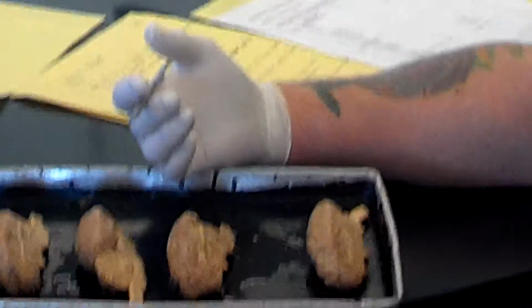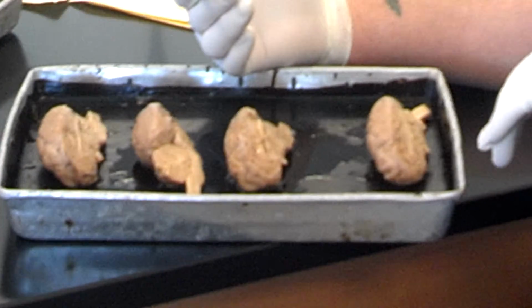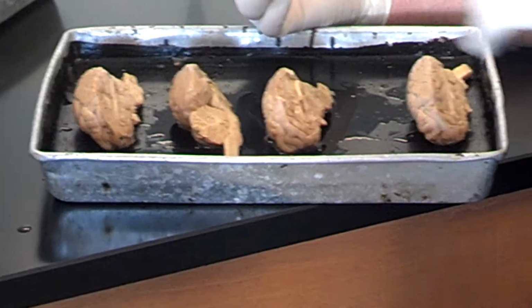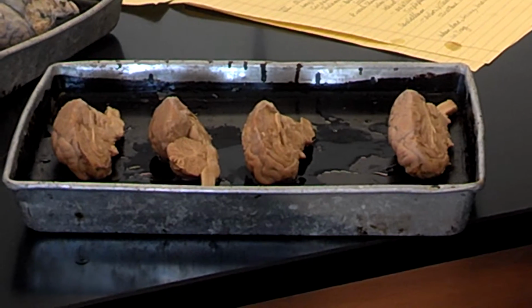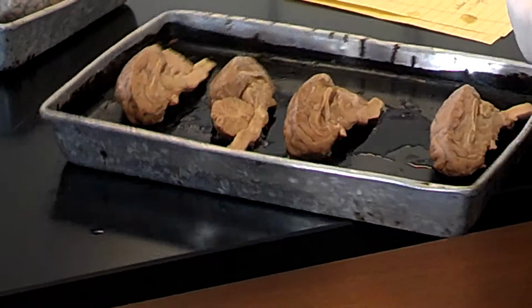and then you get back into dissecting again. You'll do one on blood, and then when you get to the cardiovascular system, you'll go back into the cats. Yeah, it'll be one of the cats. It may not be the one you had, but you'll get a cat that somebody did the muscles on, but should not have had the body cavity cut into. So those are the parts of the brain.